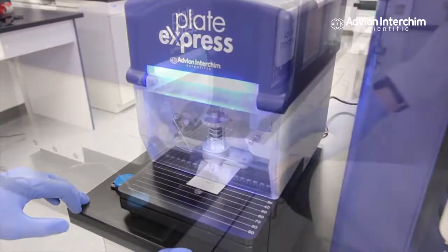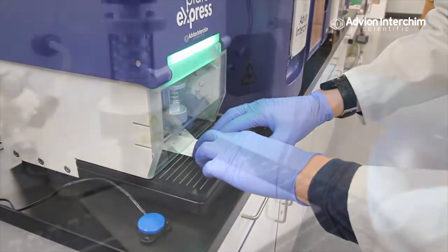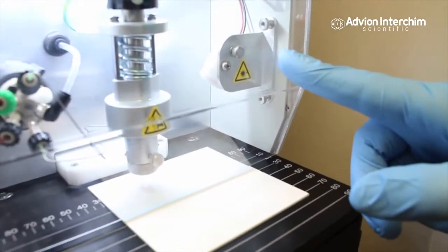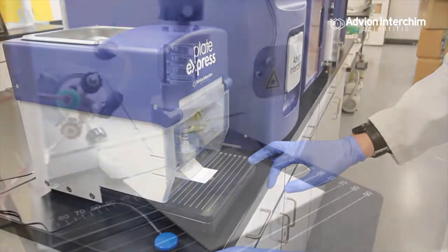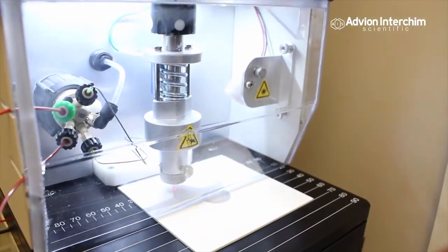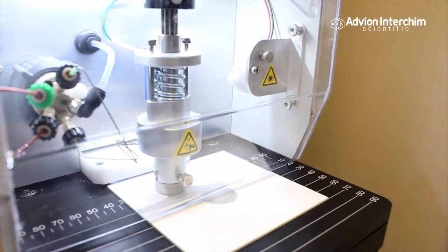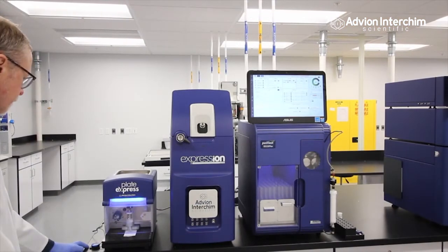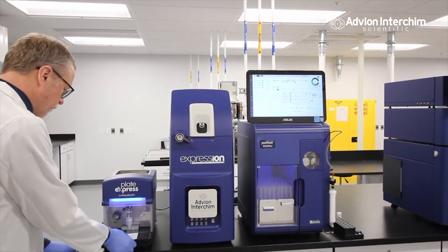To use, place your developed TLC plate into the Plate Express. Align your spot of interest and simply press the button to start. The extraction head will lower and a solvent of your choice will wash the TLC spot directly into the Expression Compact Mass Spectrometer for a technique known as TLC-MS.